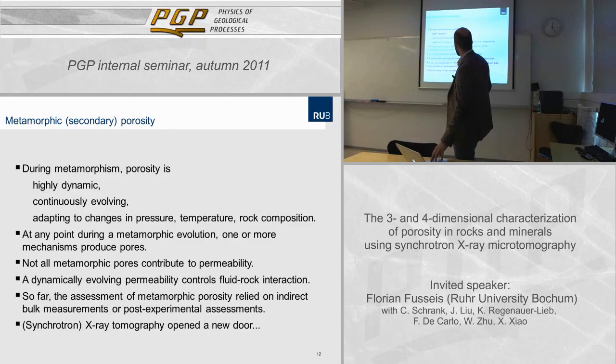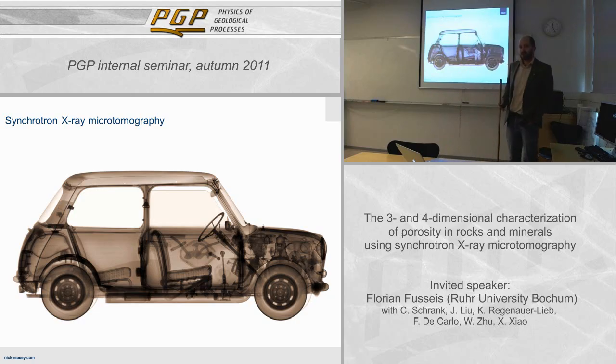Now, what is synchrotron X-ray tomography? Synchrotron X-ray tomography is based on radiography, and I found this when I prepared this presentation. I found this artist Nick Veasey, who's scanned all kinds of objects, from humans, obviously, to plants to jumbo jets. And this Mini Cooper shows you what a radiograph is. Obviously, he placed this Mini Cooper between an X-ray source and an X-ray detector, and the signal that we see is essentially how many of the photons that went into the Mini Cooper made it to the detector on the other side. So the darker the signal is, the more it is correlated to the X-ray attenuation, which is related to the density of a material. Like in the engine part here, for example, the fewer photons actually made it to the other side. So that is a radiograph.